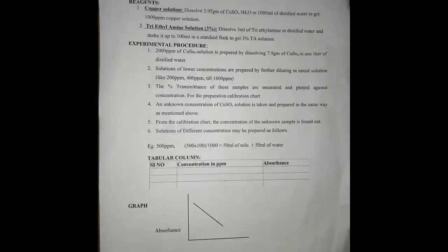Once you have prepared all the respective concentrated solutions, then you have to find out the transmittance or absorbance by using the photoelectric colorimeter. Once we note down that absorbance or transmittance, with the serial number and the concentration in ppm, suppose 100 ppm, you have to note down the absorbance or transmittance values.